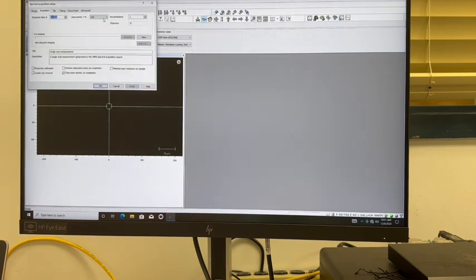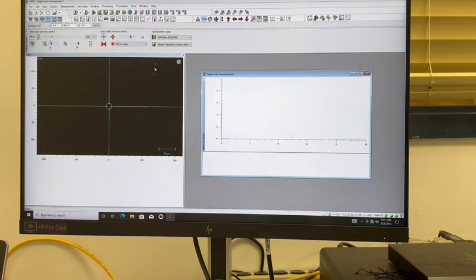So I will set up a new spectral acquisition measurement, and this time I will increase the laser power to 10%. I will then run this spectral acquisition. At 1% laser power, there is a significant amount of noise in my readings. Therefore, I am increasing the laser power. It is best to use the highest laser power that a material can take to do the Raman spectra. This will result in the cleanest spectra.